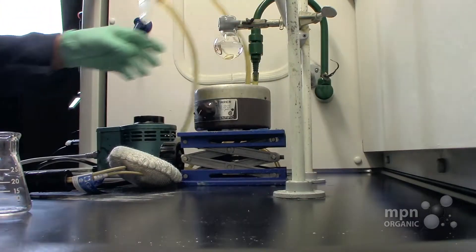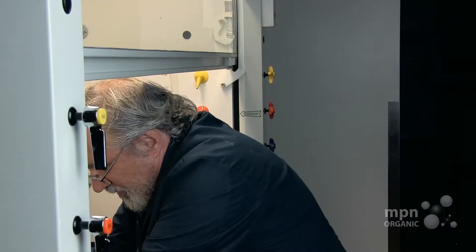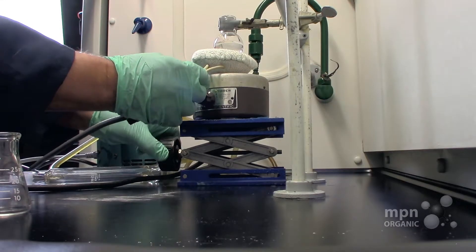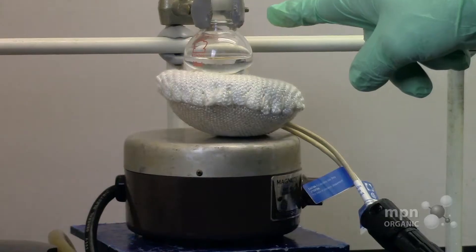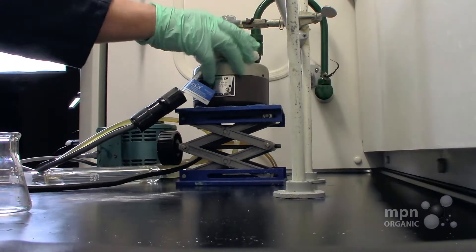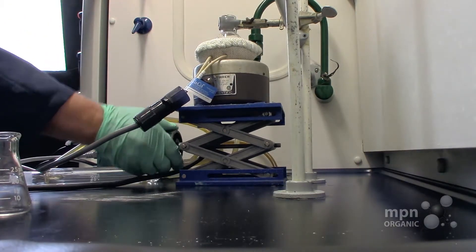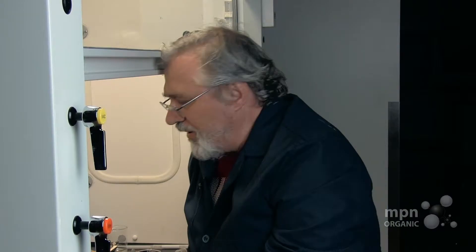So we're going to take this off like this, and let's put this up. Let us assume that this is the thing that we're going to be distilling — this particular solvent. That's up there nice and snug, and we're going to then use a three-way connector on there.